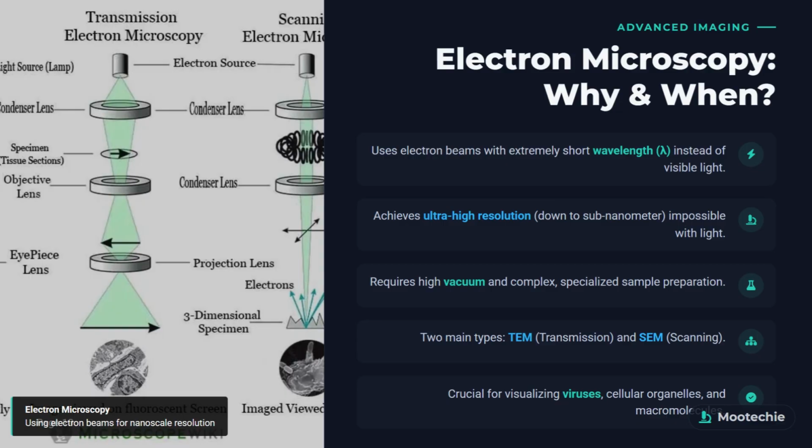It requires a high vacuum and complex sample prep. The two main types are TEM for seeing inside and SEM for seeing surfaces. It's crucial for visualizing viruses, organelles, and the fine architecture of cells.